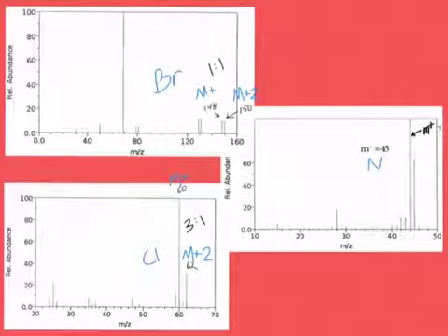Organic compounds containing oxygen or halogens always have an even molecular weight. An odd molecular weight indicates that a nitrogen atom is present. A difference in peaks by M+2 signifies bromine or chlorine isotopes. To determine which one it is, look at the intensity ratios. An intensity ratio of 3:1 identifies chlorine isotopes, and a 1:1 intensity ratio identifies bromine isotopes.